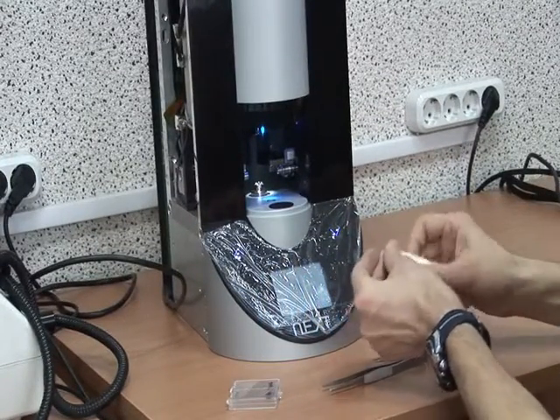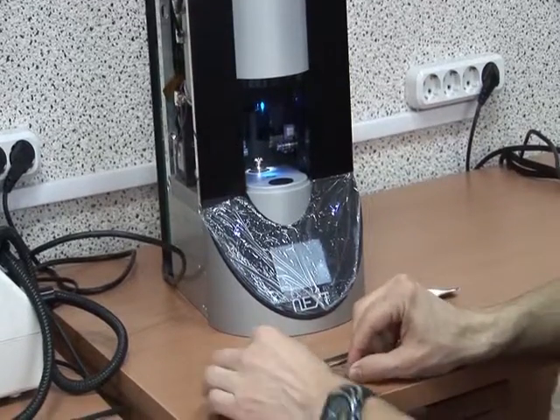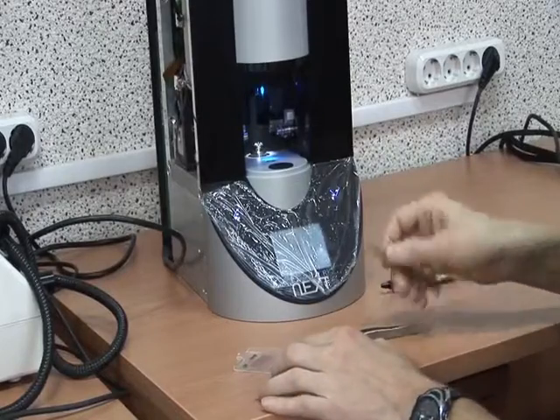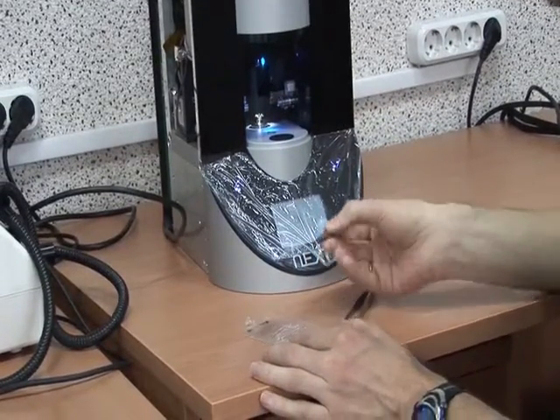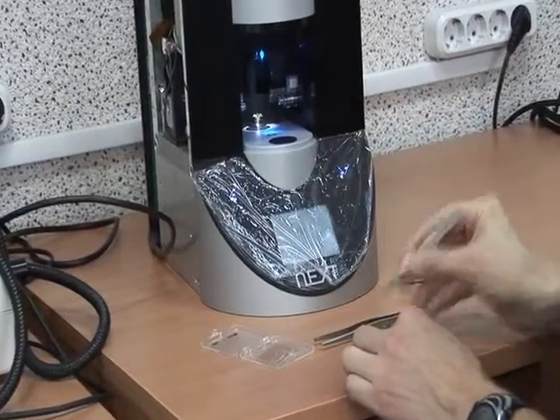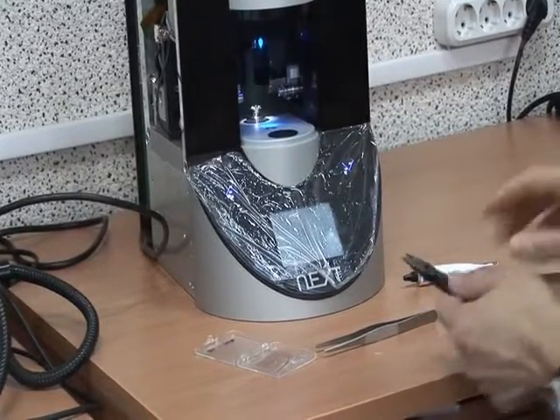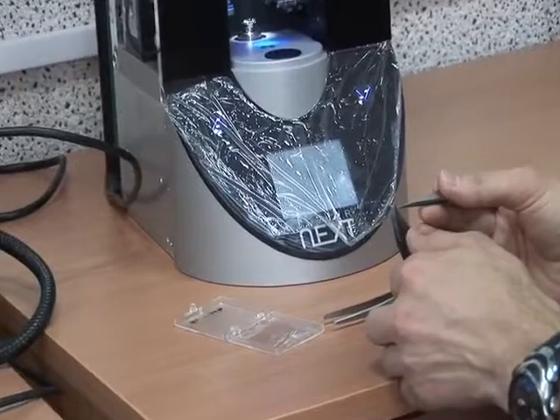Right now I'm making an STM tip. We are using platinum wire with different lengths, about 5 to 10 millimeters. To make the tip, we use sharp scissors.